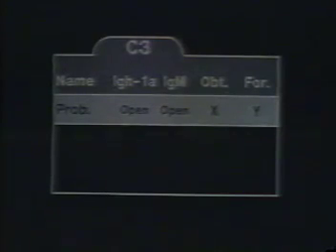It is the contour map that we saw him use to set his gates. We can see that forward scatter was plotted on the y-axis, side scatter on the x. Tom used wide open gates for both fluorescence channels so that the map would include data for all cells in the sample. Now Tom uses the insert command to add a new analysis request to this card.